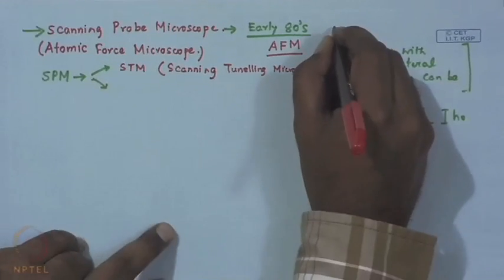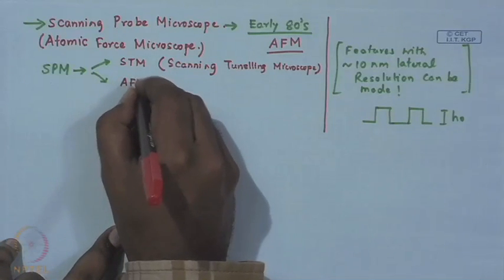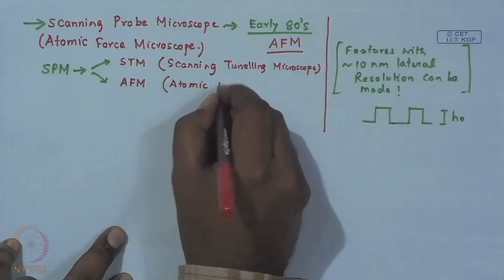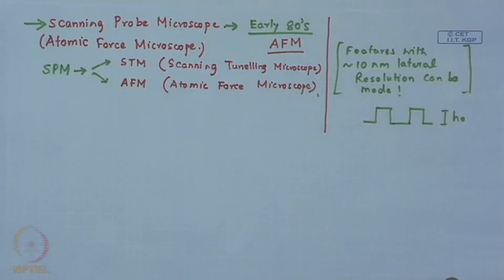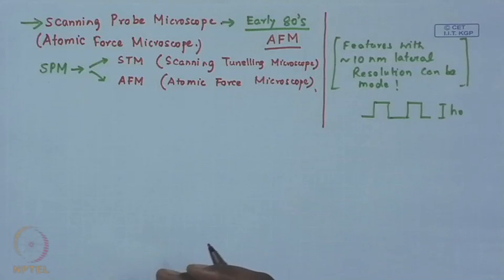What is the tunneling effect? I will discuss it very shortly, but you can just do a quick Wikipedia search on what is tunneling, and the atomic force microscope. Why I talked about STM: STM was actually the predecessor of the AFM, and based on the developments of STM only the AFM came up, but STM works only for a conducting surface. So, since we are talking mostly about a polymer surface, STM does not work. An AFM works perfectly well over there.